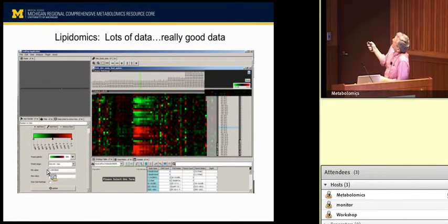What's interesting is that I want to point out two little ones here. This one and this one are the same person. We actually think the samples are mixed up. If you look at the tube it came out of, 4 and 7 are the numbers on there, but you can't really tell.